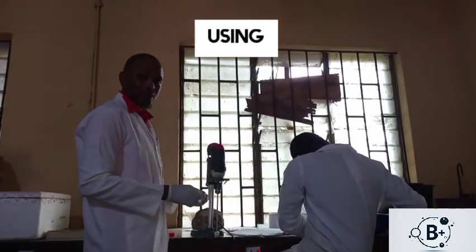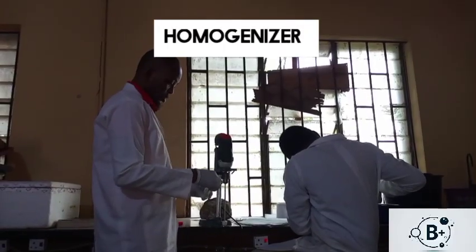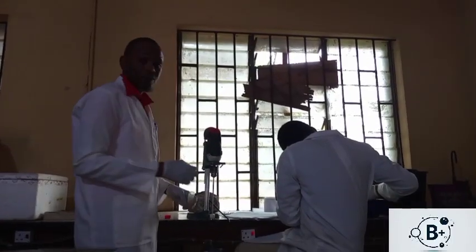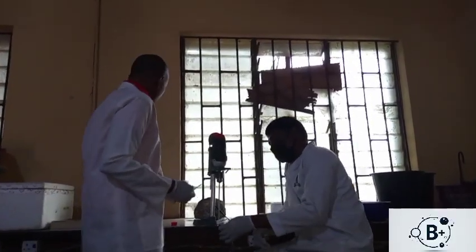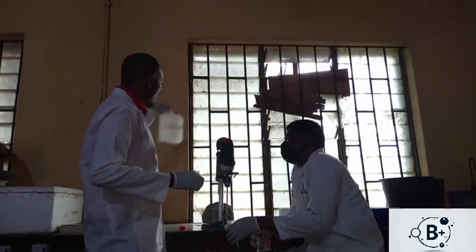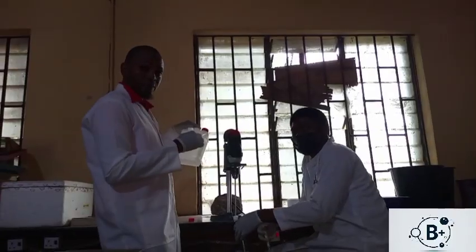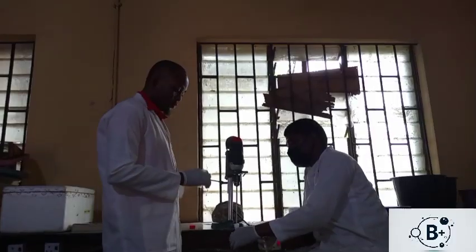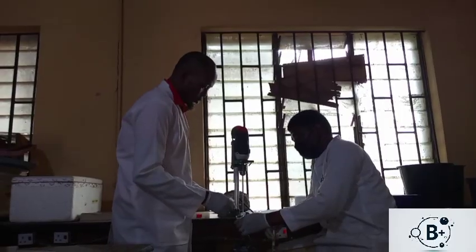So this is the homogenizing machine where we use a buffer solution to extract the content of tissues. We use a buffer solution that is already prepared. So this is the buffer solution. We use the homogenizing buffer to extract the amount of tissue for subsequent centrifuging and other analysis. So this is the process.